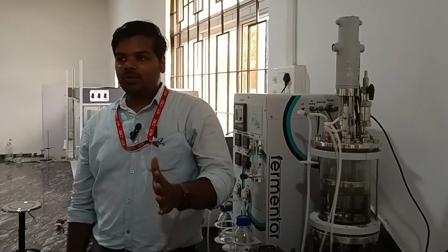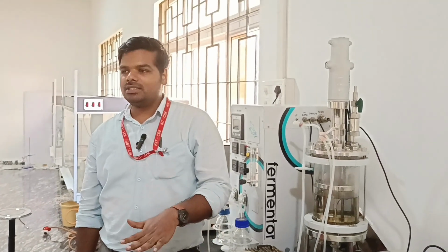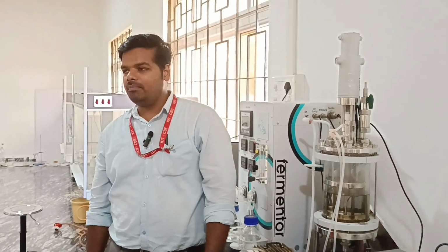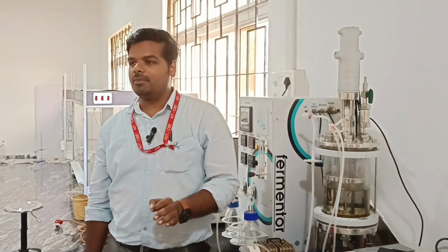So, today's experiment. What is our experiment? It's about batch sterilization, right? During the batch sterilization process, there are three stages. What are those three stages? Heating period, holding period, and cooling period. Okay. Determining the holding time is our experiment.